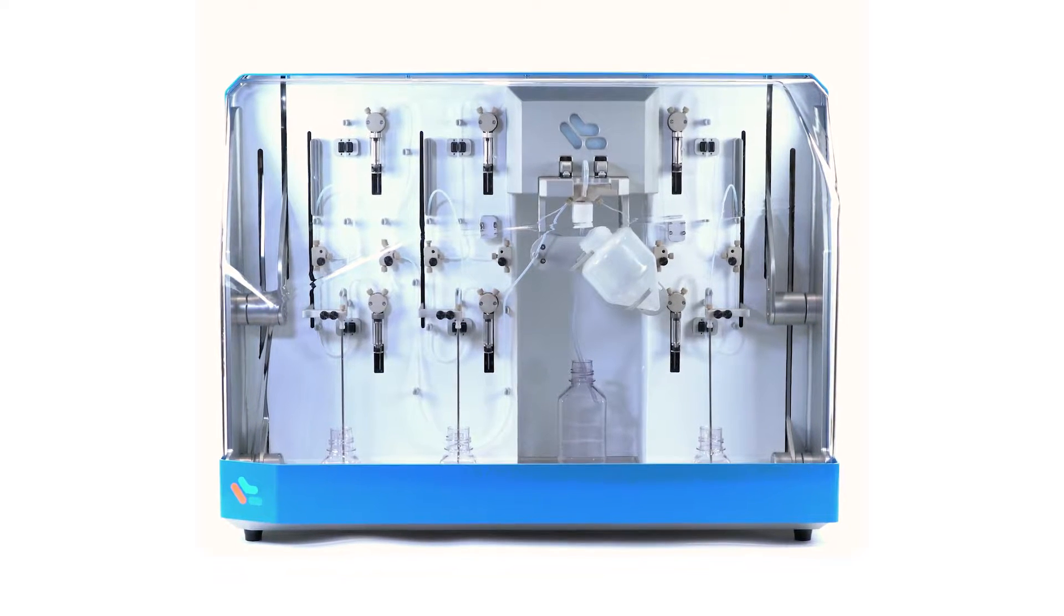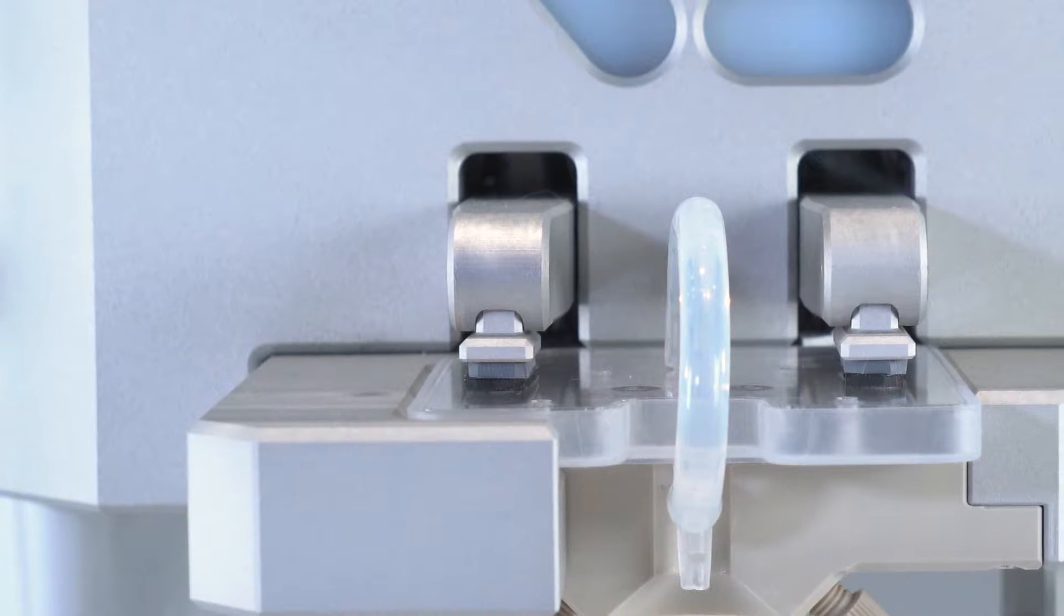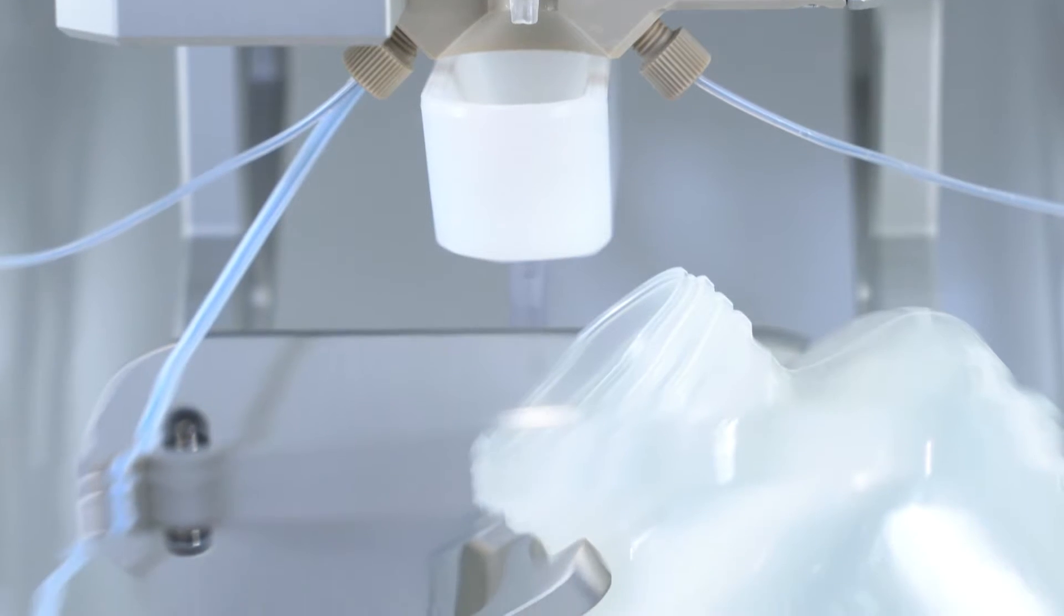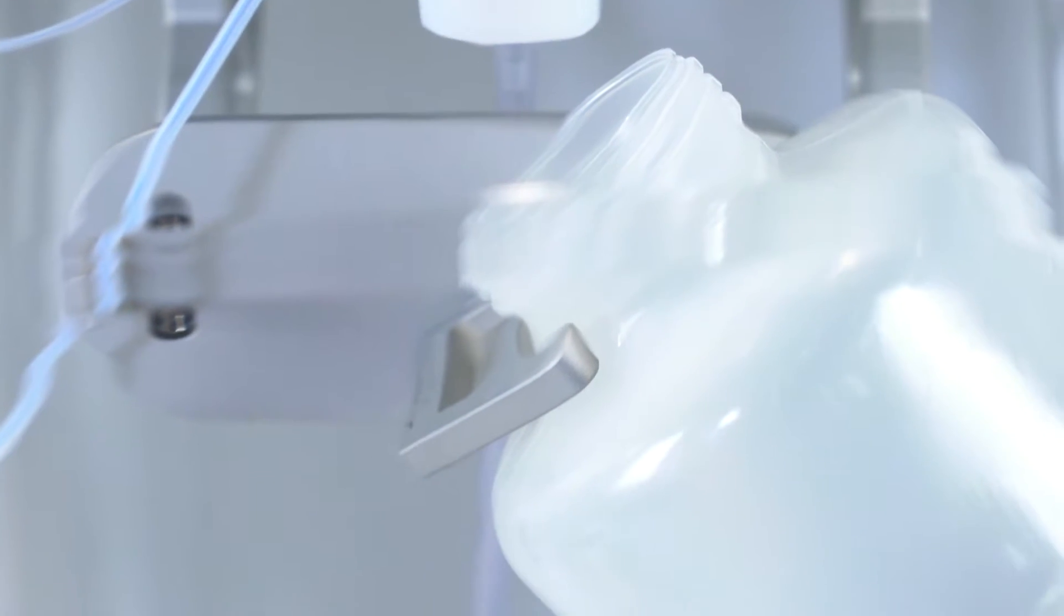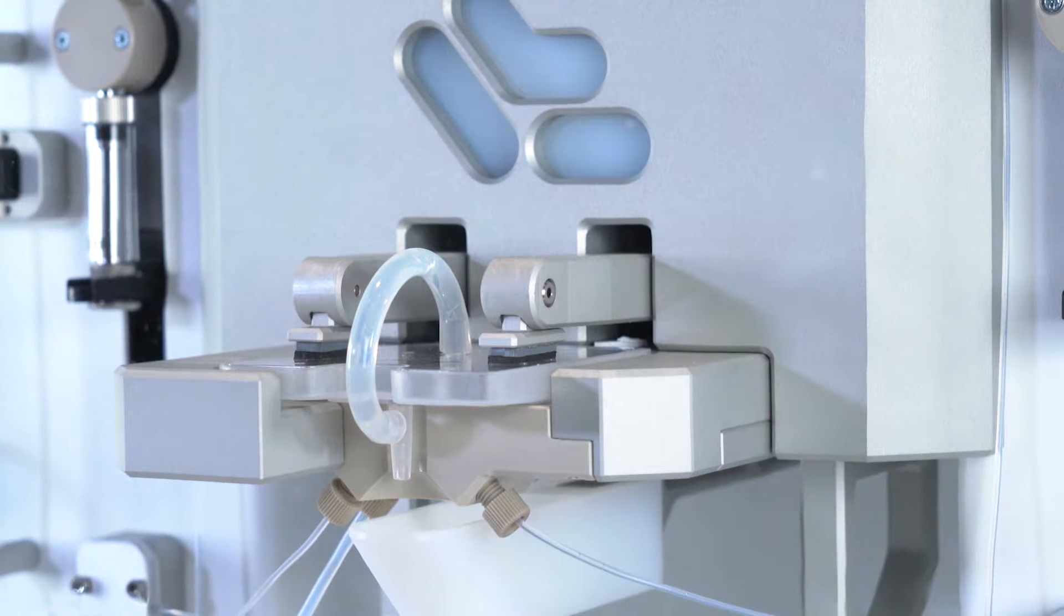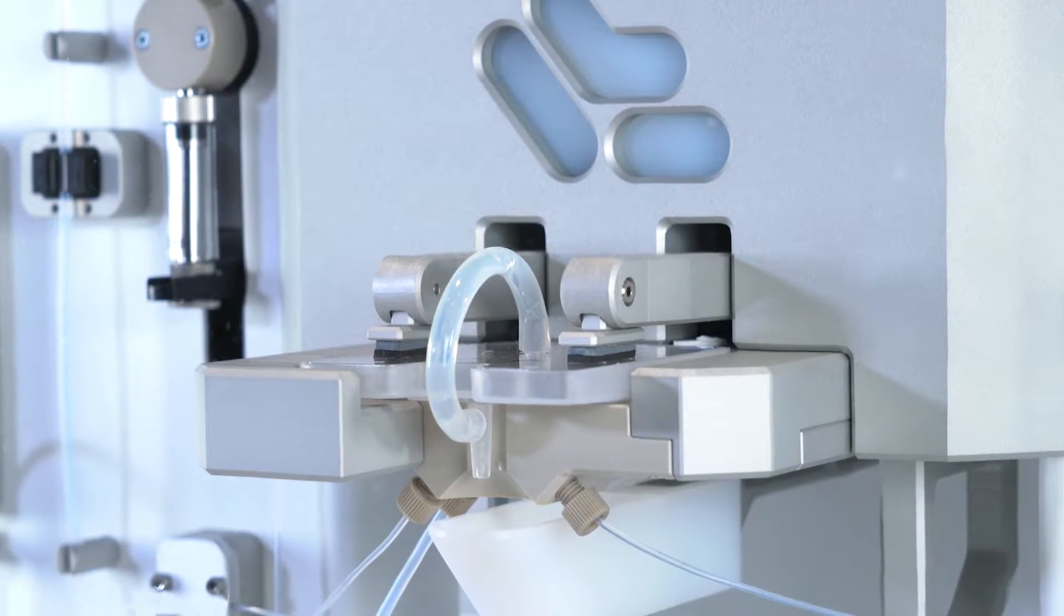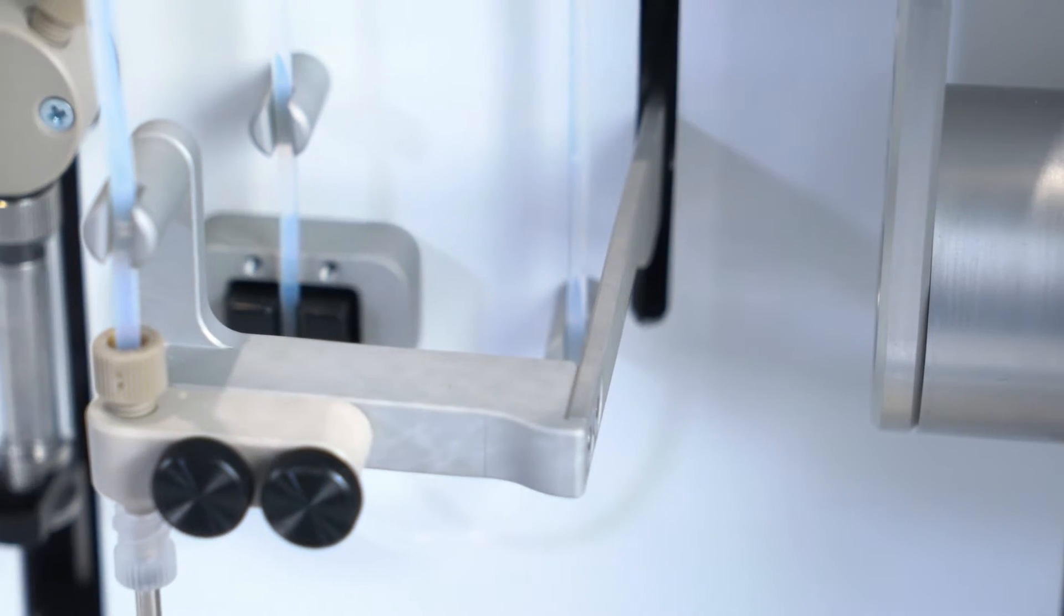The NanoAssembler Blaze was developed to allow users to manufacture drugs in an instrument format at a scale that enables larger toxicology studies, testing formulations in CMC manufacturing, and pushing those forward to the clinics.